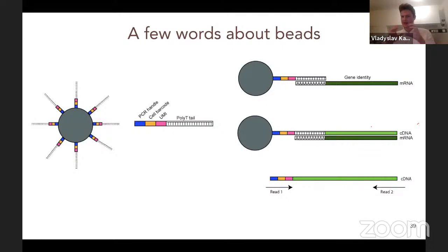So in the library preparation workflow, you have like three or four quality control steps where you can see whether your library preparation was successful or not. As well as in the tissue processing, you might know how many cells you have in your sample. So at every step till sequencing, you have these breakpoints to be sure that you have cells, everything is correct, you follow the protocol and you have the proper amount of reagents and so forth.